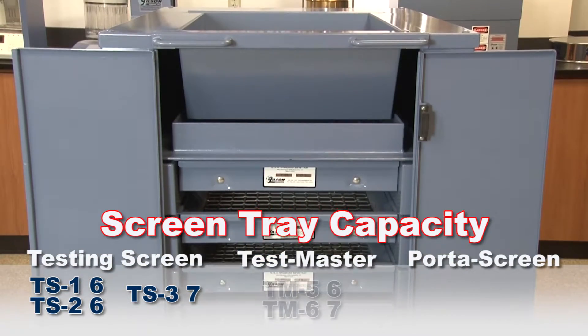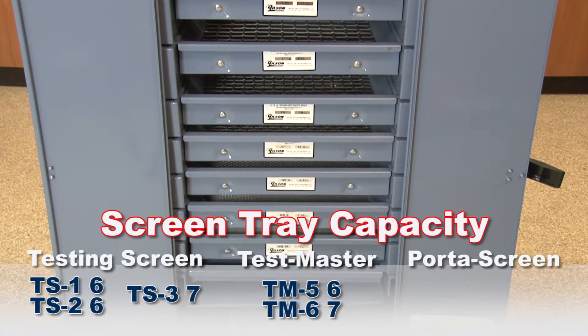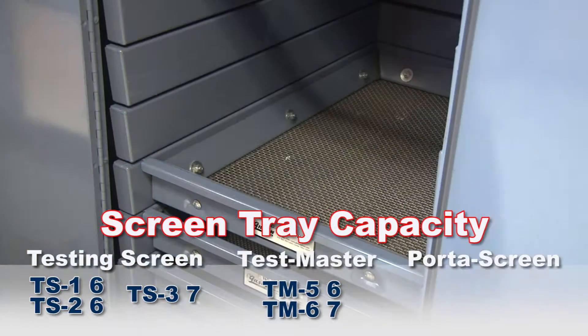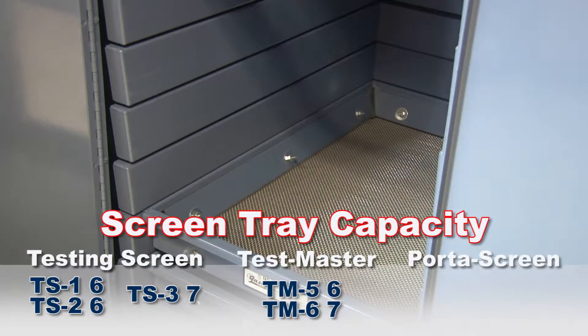The TM5 accepts six screen trays, whereas the TM6 has a seven-tray capacity. Both units have a wider tray spacing which is ideal for samples with larger particle sizes for more efficient agitation.